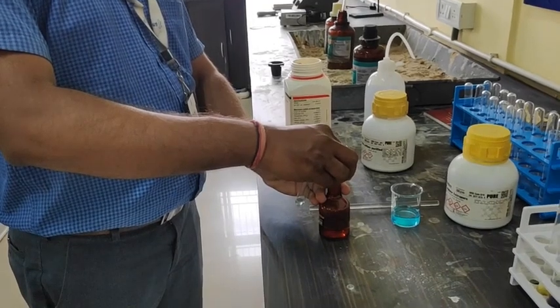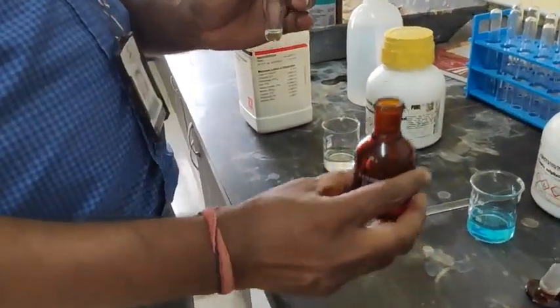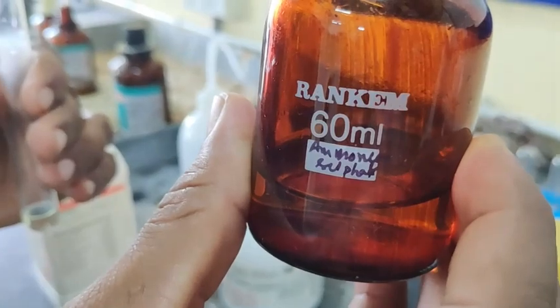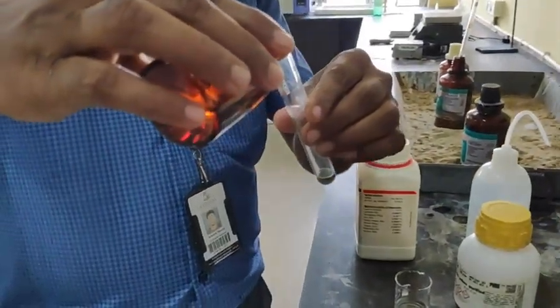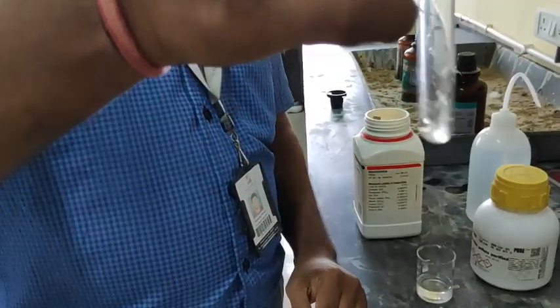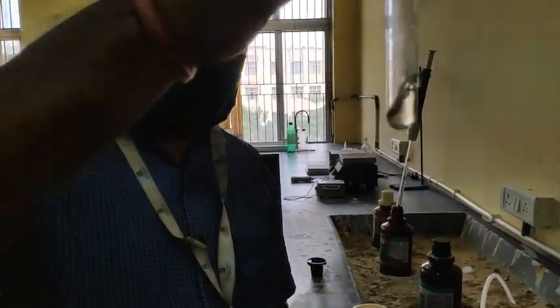Now we are going to perform the half saturation test. In this case, this is a pre-made solution of ammonium sulfate. I think you can see here it is written ammonium sulfate. Now ammonium sulfate is being added to the solution. So carefully he is adding some amount of solution. As of now, there is no change, and let's see if there is some kind of change that can occur.